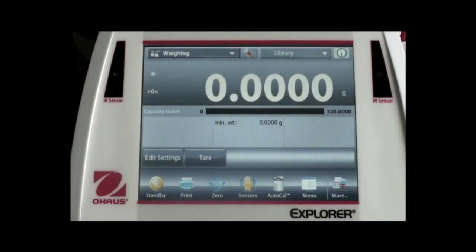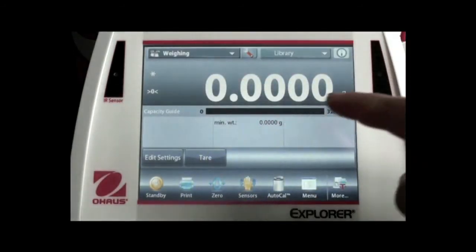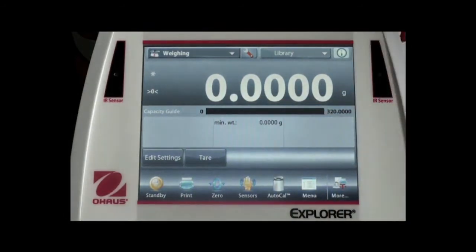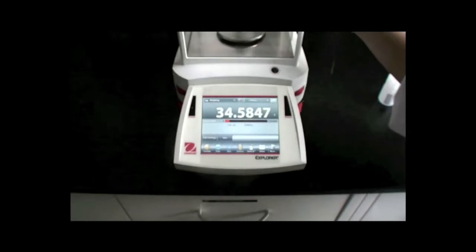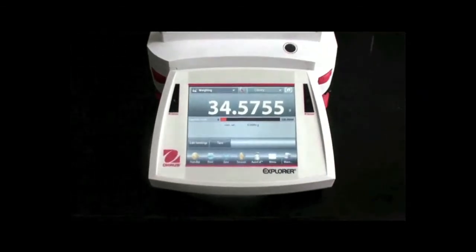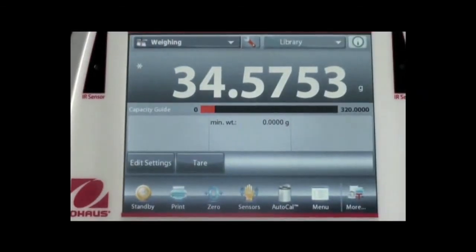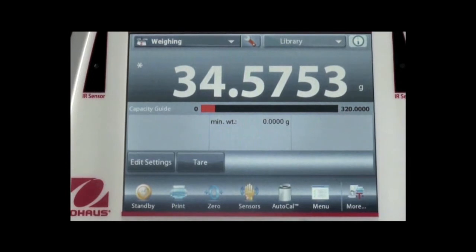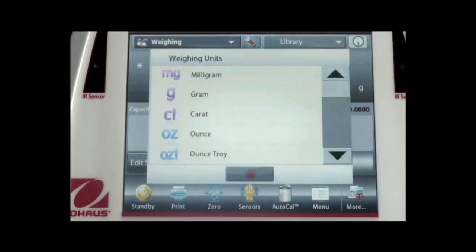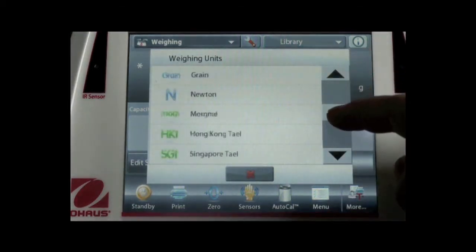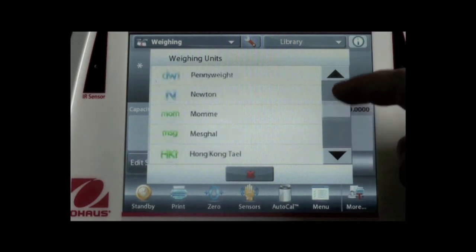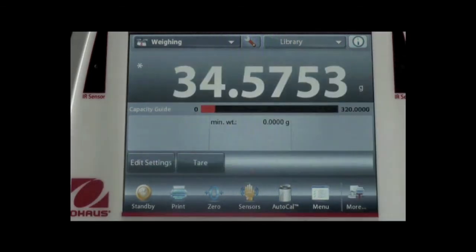The second line is the result center. You can get weighing results from this area. You can also touch the weighing unit symbol to change other units. For example, touch G and the balance goes into the 19-unit selection screen. You can change the unit just by touching the unit you need.